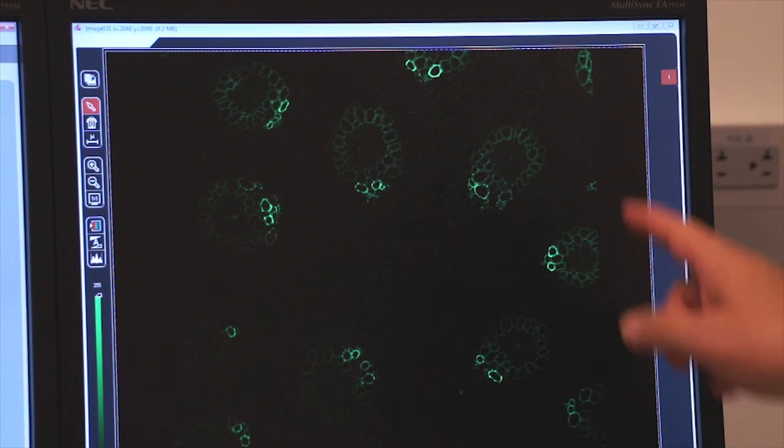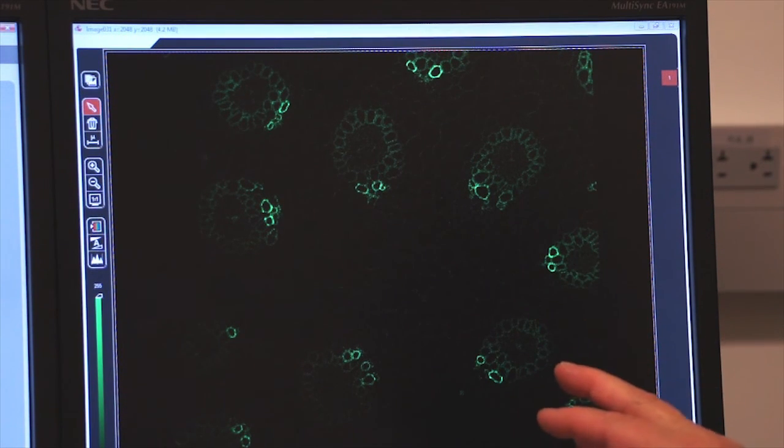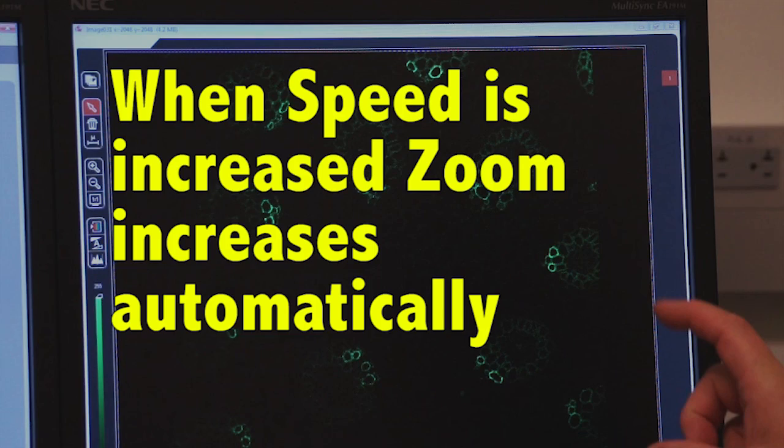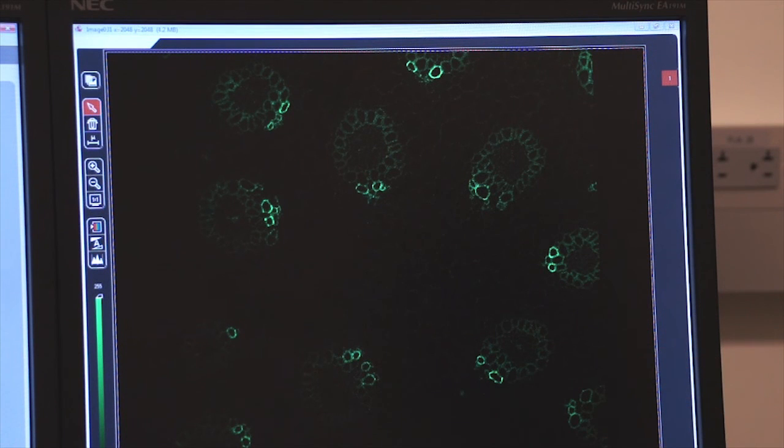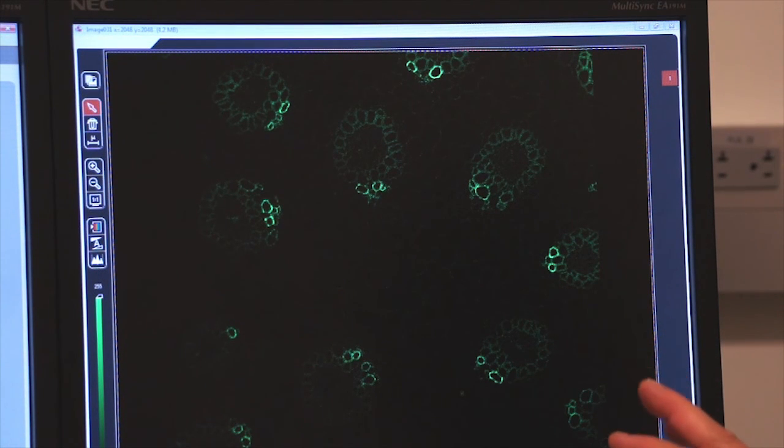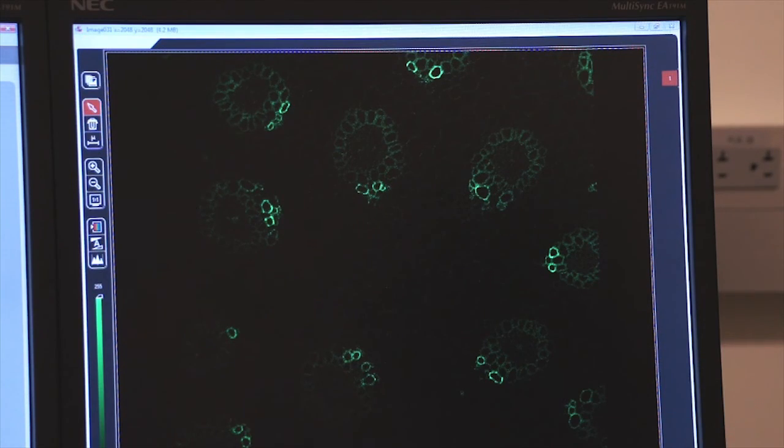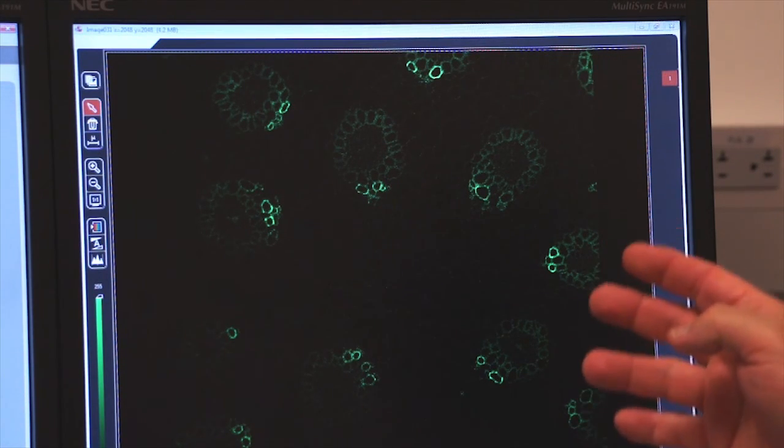But also notice something else. My image is more magnified. When I increase my speed, my zoom automatically kicks in. It's a function of the system. We can't change it. So bear that in mind. If you ever increase the speed of the digitizer, you will also increase the magnification of your image.